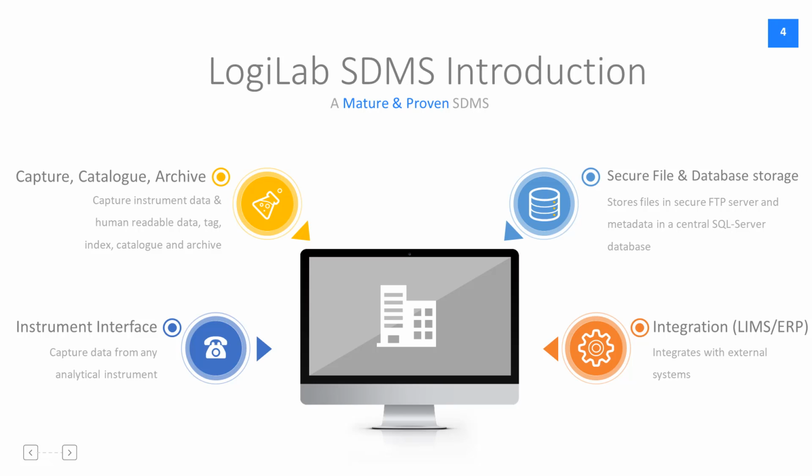LogiLab SDMS is a secure file storage system. It stores all the files in a FTP server in a secure manner, and any metadata related to the files are stored in a SQL Server database, and both the data and metadata are in a central server.